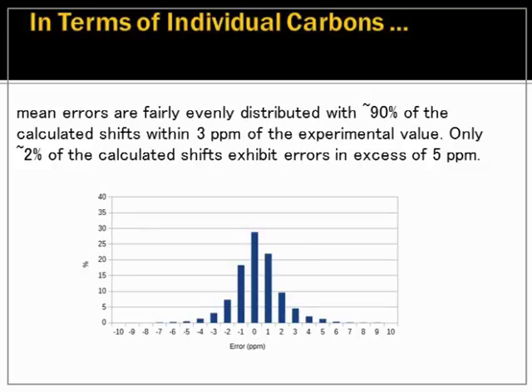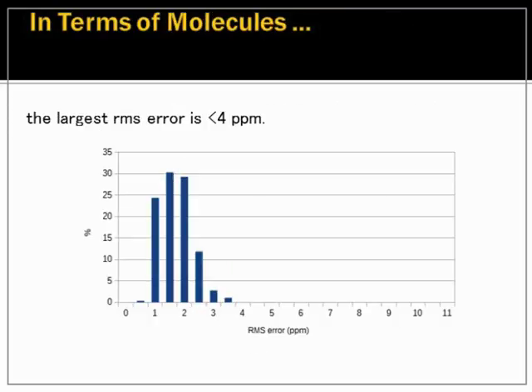The set where there were crystal structures basically flattened out at this number right here, 3.5. There was really nothing past that. Here you see there are a lot of things past that. You can forgive maybe these. You can't forgive these. These are wrong structures. I don't want to pick on the experiment, but this is a way of filtering out at a very early stage things that are wrong.